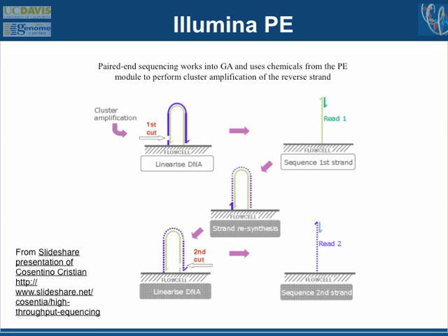Paired end technology is really important if you can figure out a way to do it for a 10 kilobase piece of DNA or a 100 kilobase piece of DNA. If you can read the ends and you know that they're 10,000 base pairs apart, that can be really important for building haplotype structures or assembling genomes.